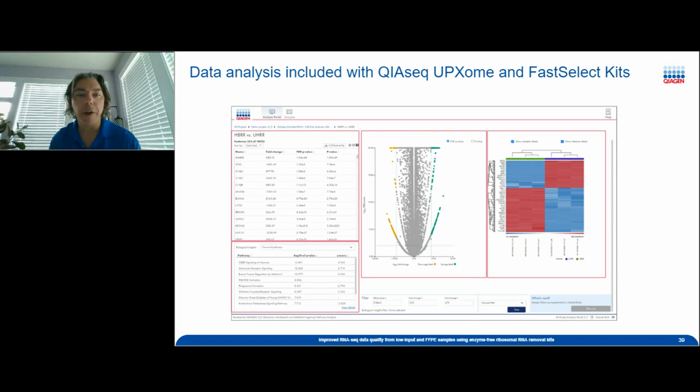In the middle here is a volcano plot. So here you can see to the right are genes that are upregulated. To the left here in gold are genes that are downregulated. And I've filtered this data set a little bit here. So the ones that are in gray are outside of the bands. And the bands are set down here. You can either drag this, or I have the amount upregulated and a p-value here.